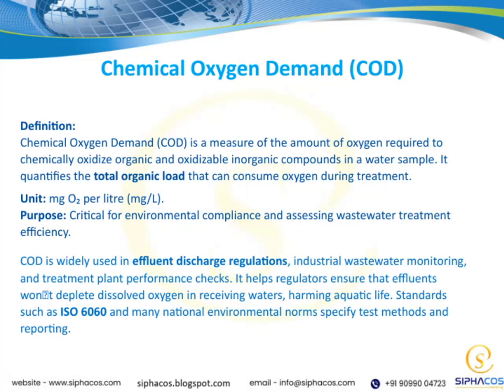Let's take a closer look at chemical oxygen demand, or COD. Essentially, COD measures how much oxygen is needed to chemically break down organic and certain inorganic compounds in a water sample. It's a way to quantify the total organic load. That is, all the stuff that can consume oxygen during treatment. When we talk about units, we're referring to milligrams of oxygen per liter of water, or mg/L.